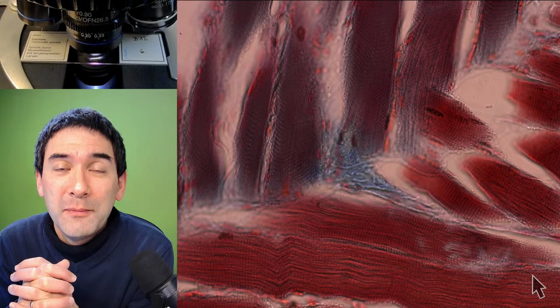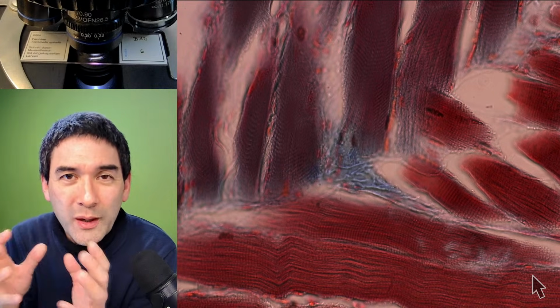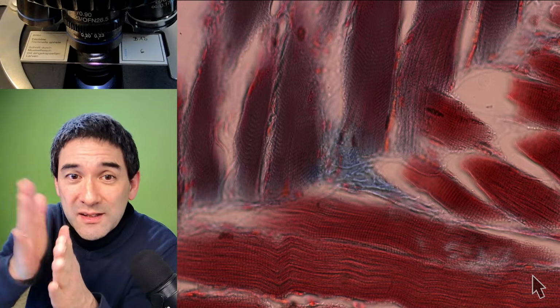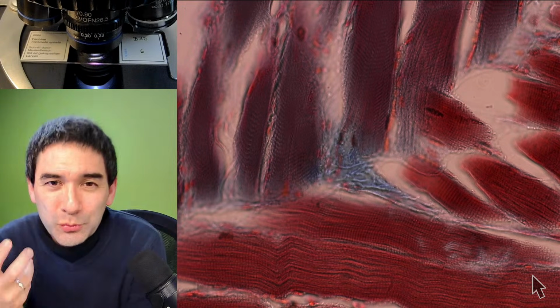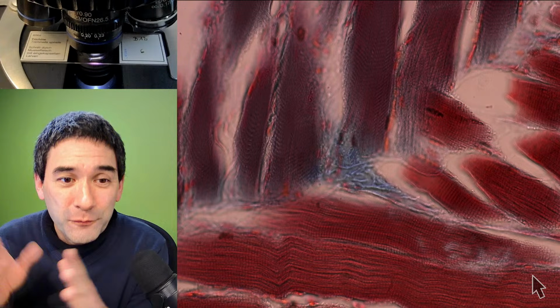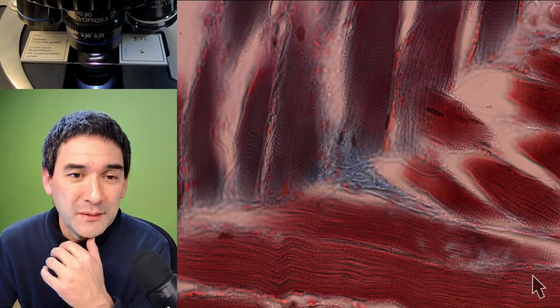So people realized already at that time, wow, on a microscopic level, the structures are quite similar. And they were surprised that in a huge whale, the distance of those stripes is the same as in a tiny insect. I think in biology, it's a remarkable realization about the so-called commonality of life. The deeper down we go into the cells, the more similar the living things start to become. Okay. So for this reason I like this slide here.